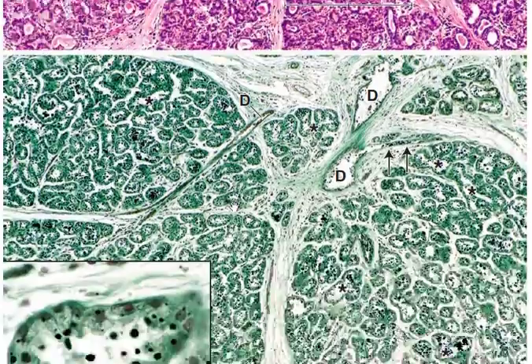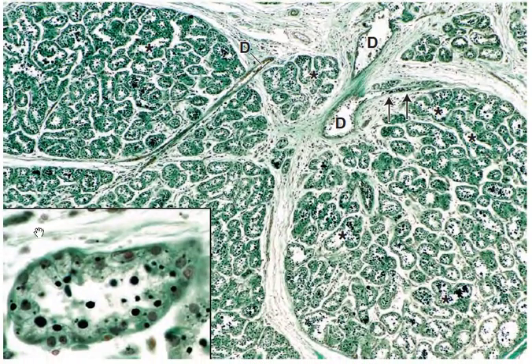Let's look at this last picture. You guys are probably tired of hearing my voice. The specimen shown here is from a lactating mammary gland. Look at that. That's cool, huh?